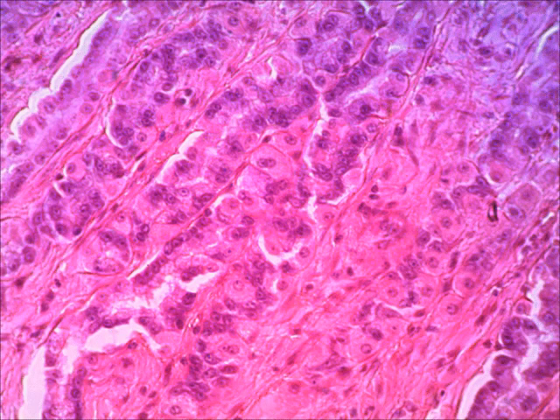The chief cells are ones that you see right here and right here. Notice that their cytoplasm is more of a bluish color. Now, they all have a bluish colored nucleus, but look in the cytoplasm. See how it's a little darker here? Those are chief cells, and they produce enzymes like pepsin. On the other hand, the parietal cells have more of a pink staining cytoplasm, and they tend to be a little bit larger. Those cells produce hydrochloric acid. So here we see some on the right. And then on the very far right bottom corner, you see quite a few chief cells.